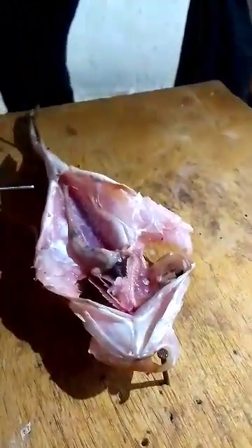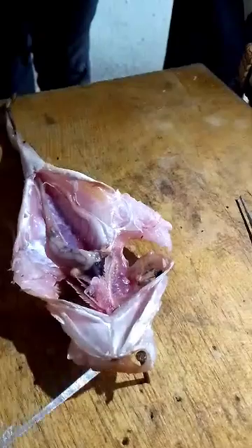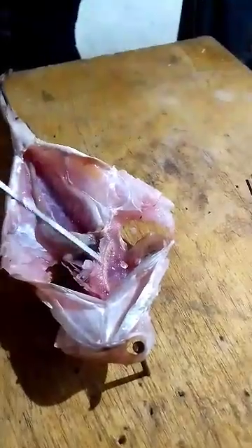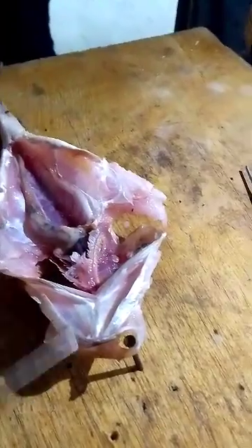For gas exchange in the fish, the fish takes water inside the mouth, passes it through the gills, and it goes out through the operculum. As water enters through the mouth and exits through the operculum, it gets in contact with the gill filaments, and gas exchange takes place.